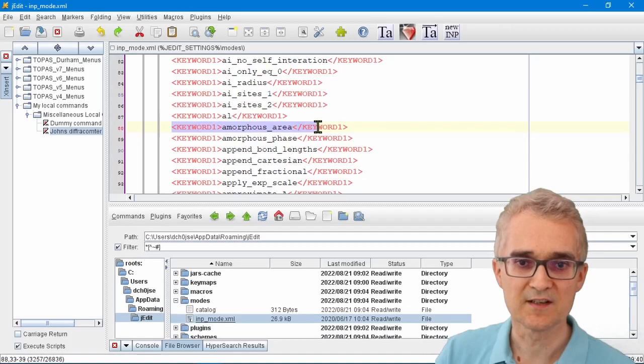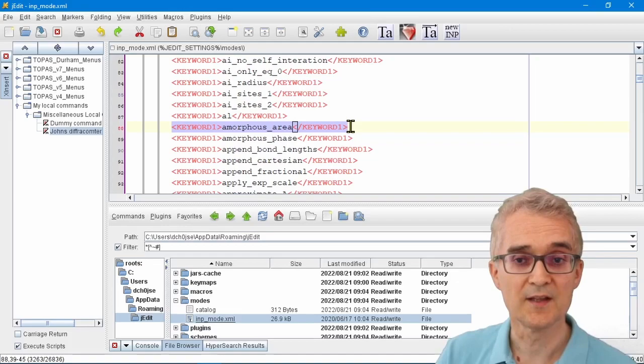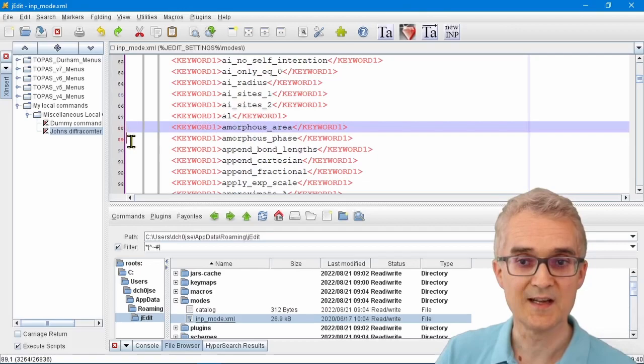For example, a word like amorphous area is a Topaz keyword, so it's given this little flag keyword1, and that tells jEdit that's a word that needs to be color-coded. You can add your own phrases in here if you want them color-coded.